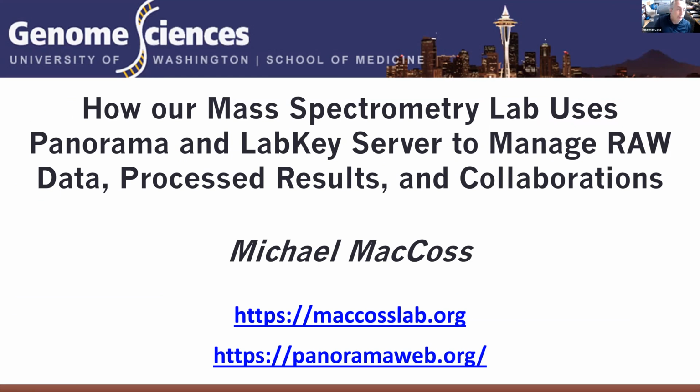I want to bring up a little bit about how our mass spectrometry lab uses Panorama and LabKey, and I'll explain what Panorama is, to manage our mass spectrometry raw data, our processed results, and our collaborations. This is definitely a work in progress and something that's constantly being improved. That's one of the great things about working with LabKey: it's an active project under development, and we find that particularly satisfying.